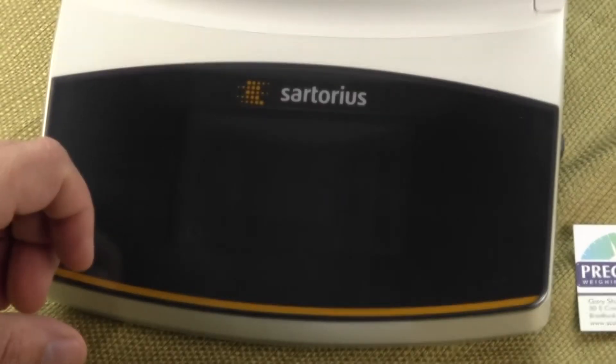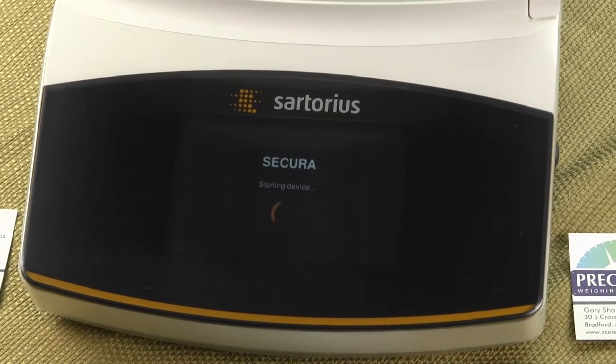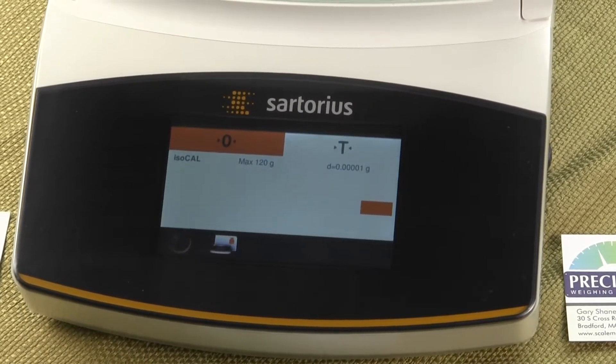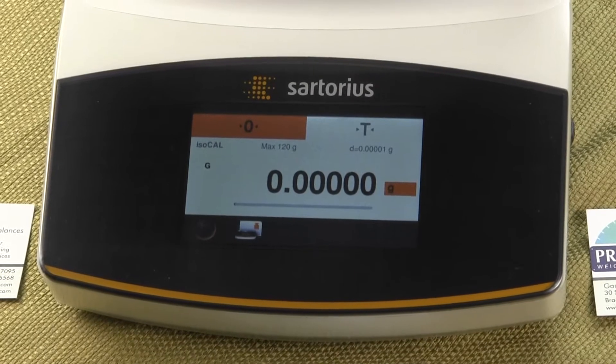Presently, the balance is in standby mode and we're going to press the button in the lower left-hand corner. When doing so, you can see the balance powers up and then we get the display screen. The laboratory balance returns to the last configuration.